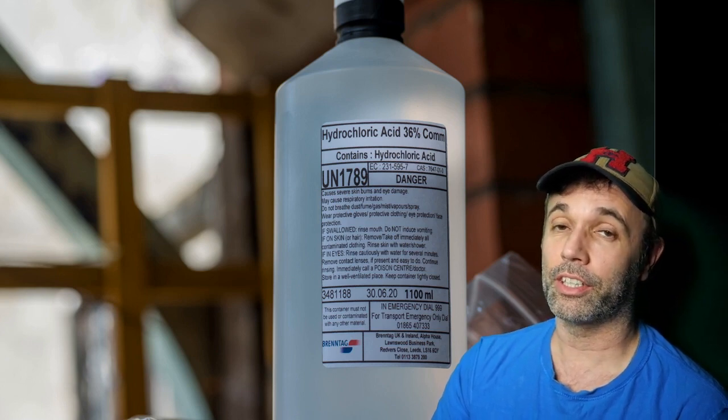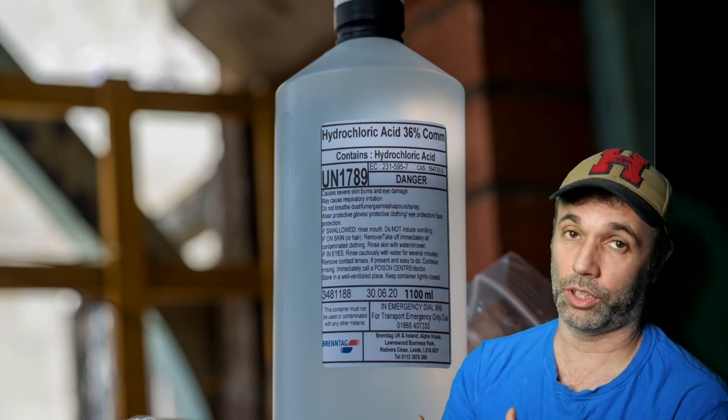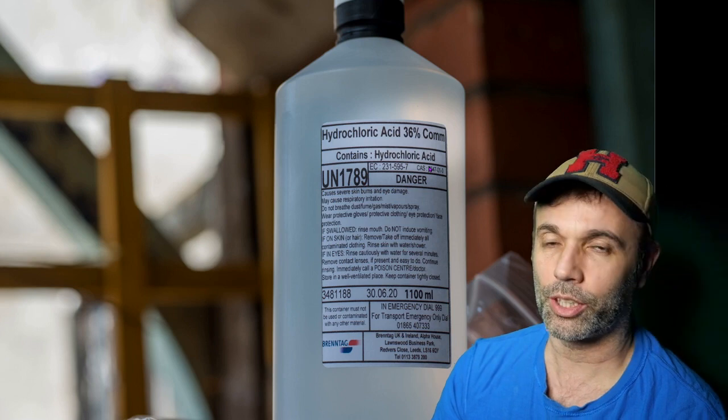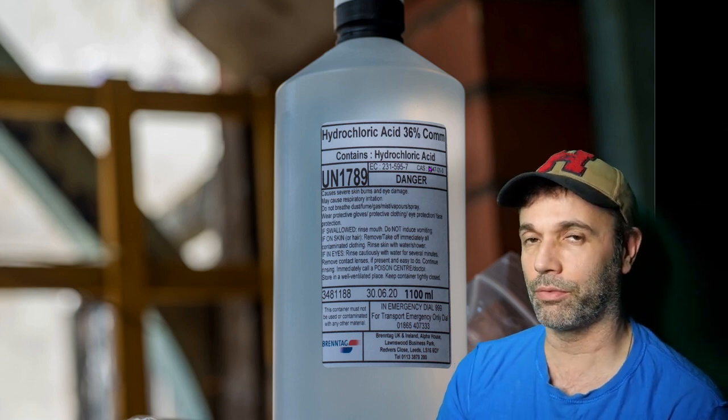The only acid I could find online that I could buy just by mail order was concentrated hydrochloric acid at 36%. So what does 36% strength mean, first of all?